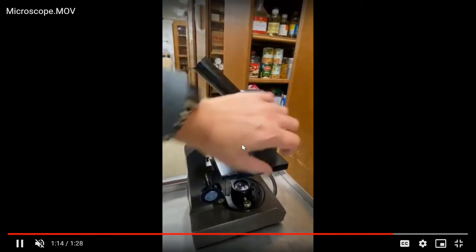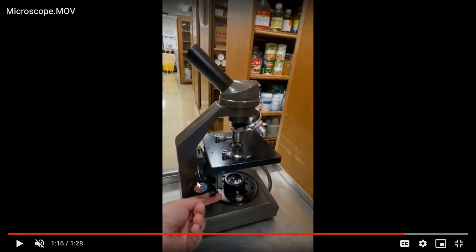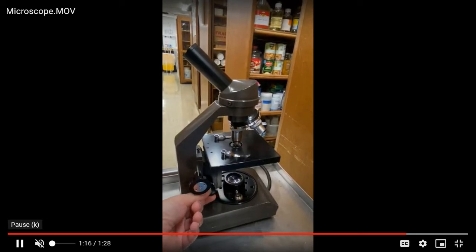Once you get as clear as possible, then you can go to high power objective if you like. Again, in high power, you are never using the course adjustment. You can see just how close that objective lens is, and imagine a microscope slide being right here. So you don't want to move that one. It'll move it way too much. You just want to use the fine adjustment in order to get it into good view.